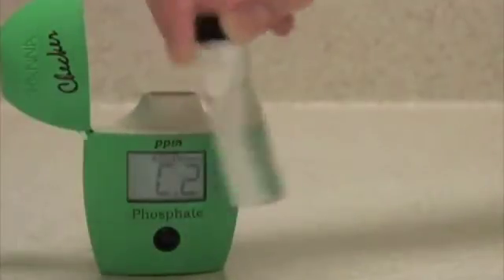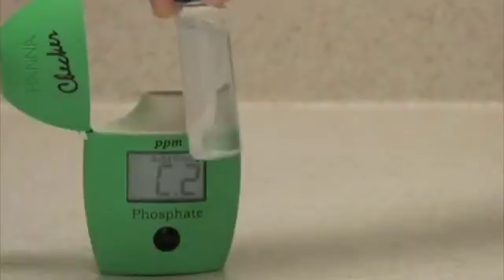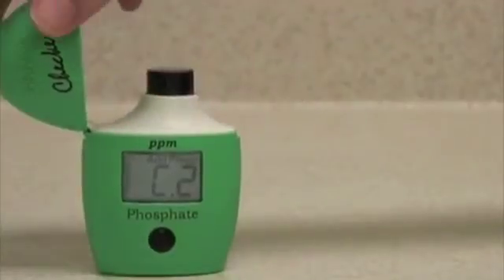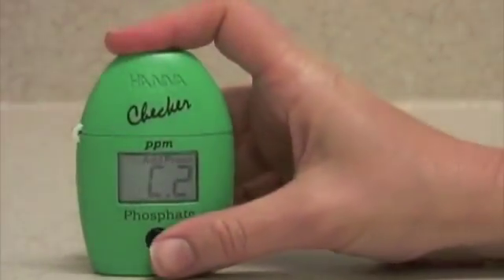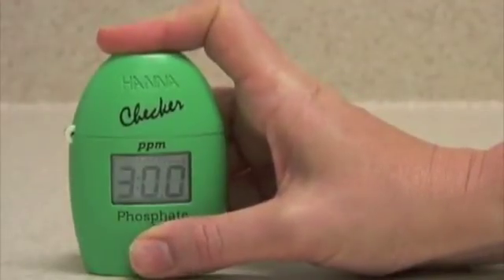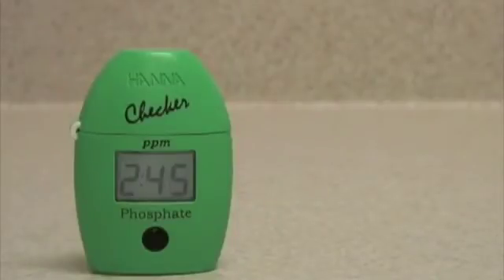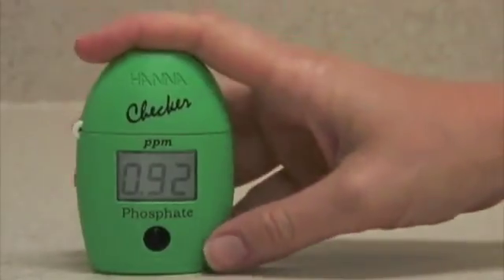The sample begins to turn blue as it reacts with the phosphate in the water. Insert the vial back in the meter, close the lid, and press and hold the button to activate the timer function. The meter will now count down three minutes for the reaction to take place. After three minutes, it will automatically analyze the sample and display the reading. The meter now displays the concentration of phosphate in parts per million that was in the water sample.